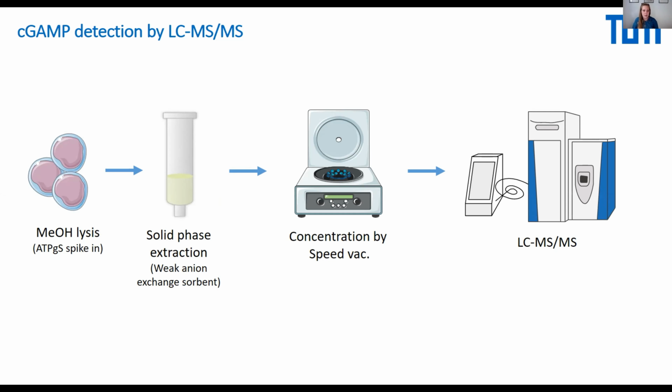Then we do a solid phase extraction, which is a weak anion exchange sorbent, so essentially just a spin column. I concentrate by Speedvac, and then we send it to Martinsried, to the BayBioMS, where the metabolomics core facility measures the nucleotides, the cGAM specifically, on a targeted approach on LC-MS.